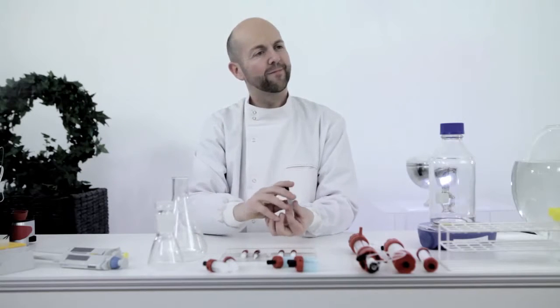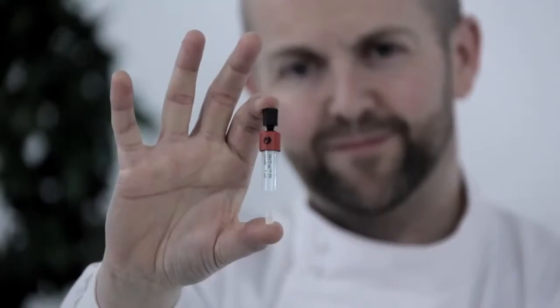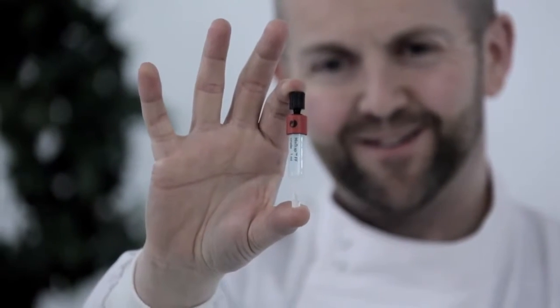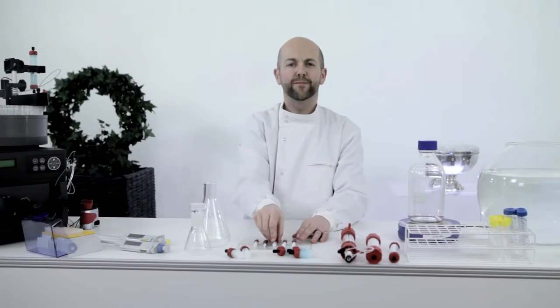In this video, Mike will share his tips and tricks for getting the best out of the HisTrap fast flow crude column, an excellent way to purify histidine tagged proteins directly from unclarified cell lysates. Hi Mike, tell us more.